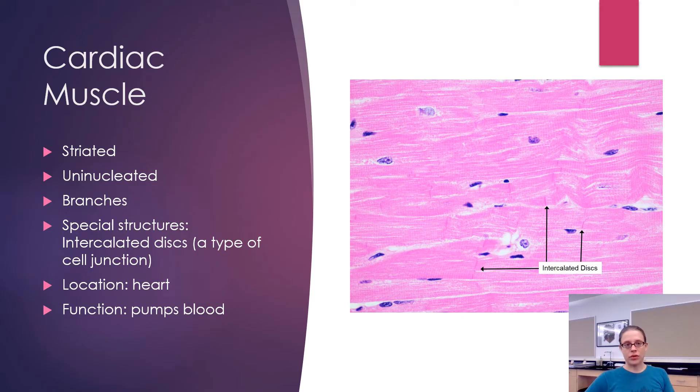Also, you can differentiate between cardiac muscle and skeletal muscle because cardiac muscle have these little purple lines. There's already something pointing to them, but I'll highlight it. These purple lines in between the individual cardiac cells, which are called intercalated discs, which is a type of cell junction.